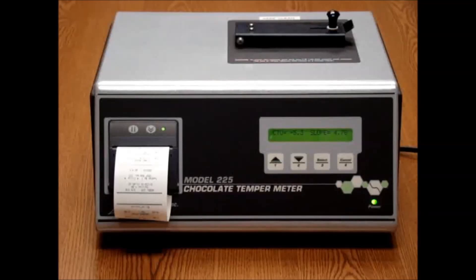The results will print out on the internal printer, providing a slope and CTU reading. In theory, a slope of zero is perfect temper. However, most users say they keep the slope between positive 1.0 and negative 1.0, trying to achieve as close to zero as possible. Tricor recommends performing some tests to determine what is best for your chocolate. Please refer to the temper curve interpretation document for more information.